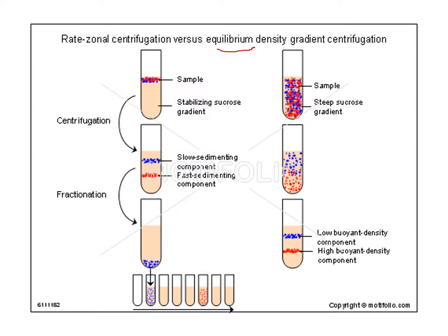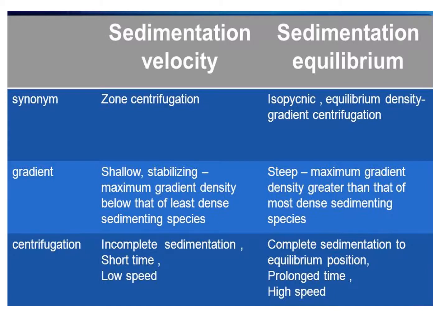Anyway, it just shows our fun fractionation there at this point. And again, these materials may not have color, or they could. You could stain them. Okay, so here's a chart comparing the isopycnic. See right here, iso versus rate zonal. So take your notes. See, they say zone, but they should say rate zonal, isopycnic. Okay, they mention isopycnic here.